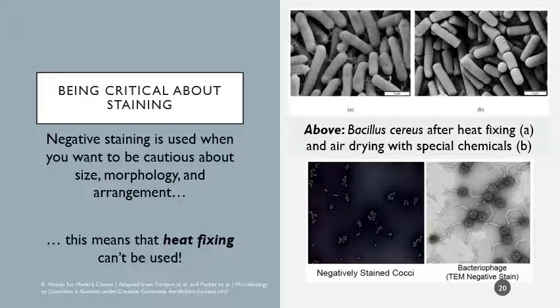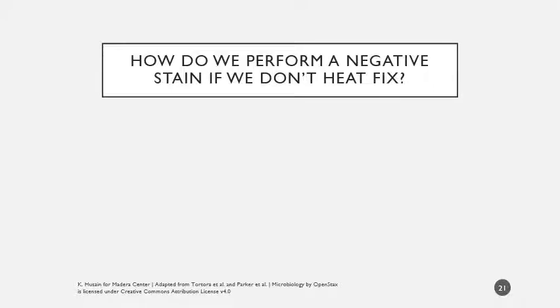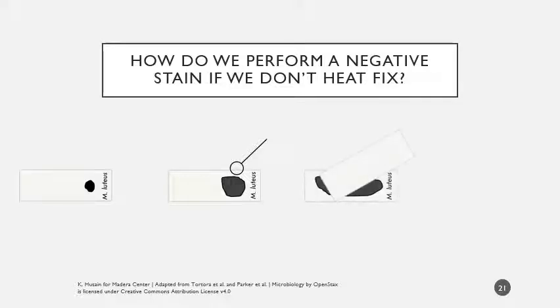So when we're thinking about that special type of staining, which is sort of a simple stain, but goes beyond that, we do that with a special protocol. We put a little bit of the black dye onto a slide. We inoculate it with culture and move that around. And then we use a slide at a 30-degree angle to drag that smear across the slide.